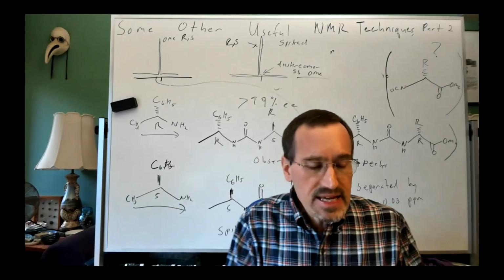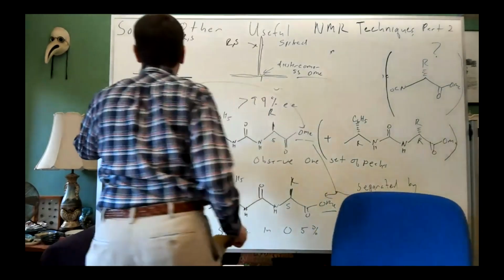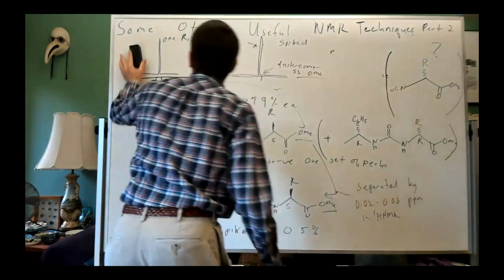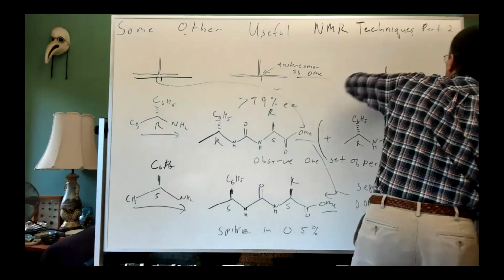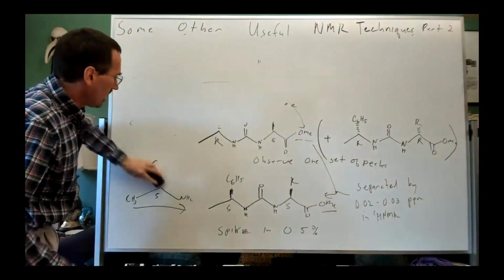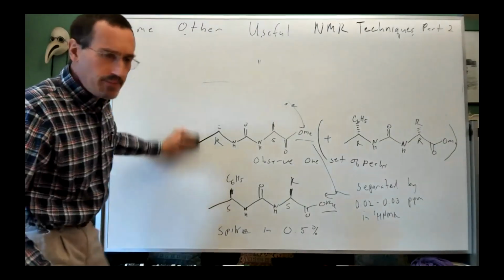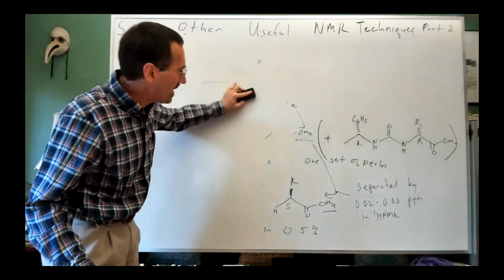All right, I think at this point, I want to talk about another technique that I find very useful. And in fact, right now, a graduate student in my group, Zing, is probably going to need to use this technique in order to establish that one of his compounds is pure for the purposes of publication.